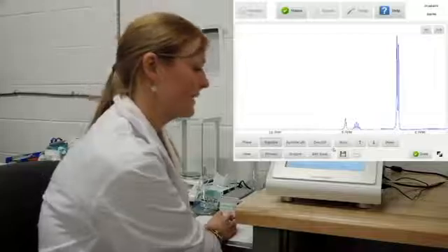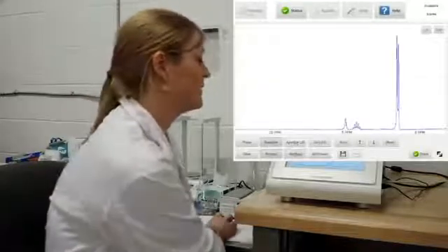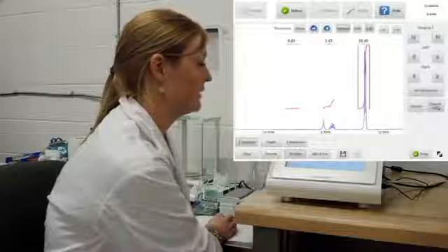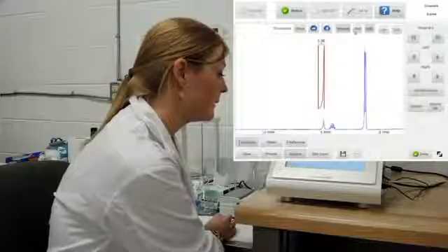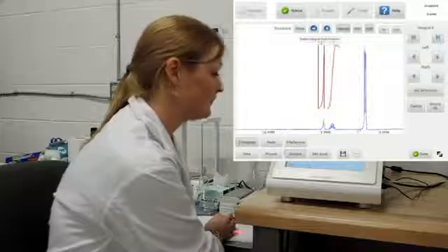I'm happy with what my baseline looks like as well as my peak, so I'm going to skip apodization and zero fill, and go directly to my integration. It pulls up the ones I had last time, so I'm going to start by deleting all, and then adding the regions of interest here. I'm going to pick my hydroxyl group, my methine, as well as my methyl groups.